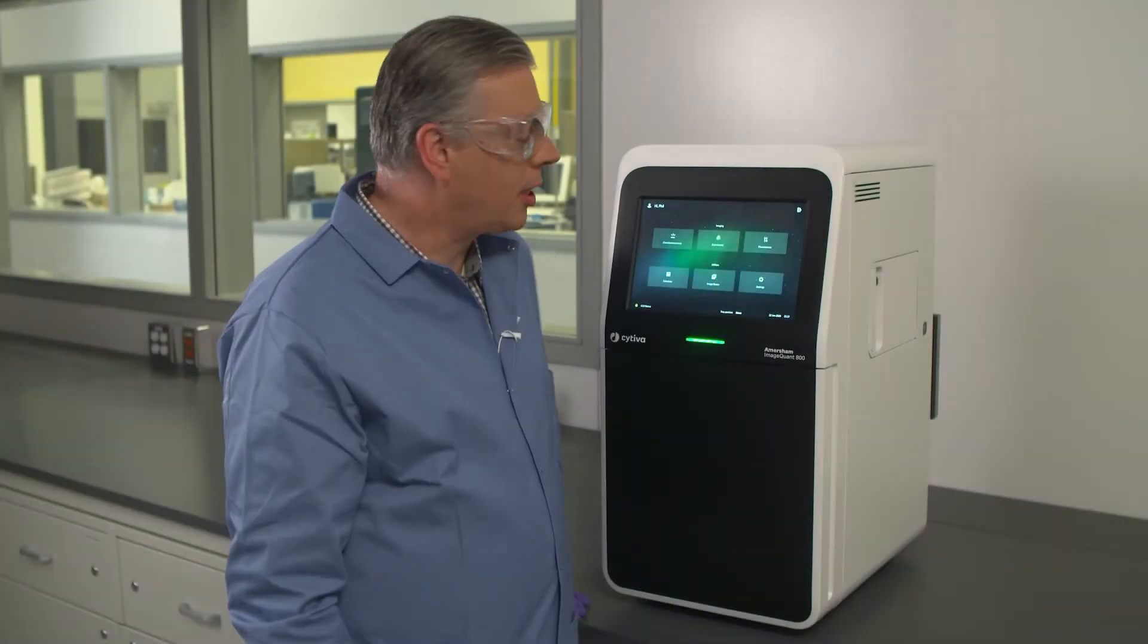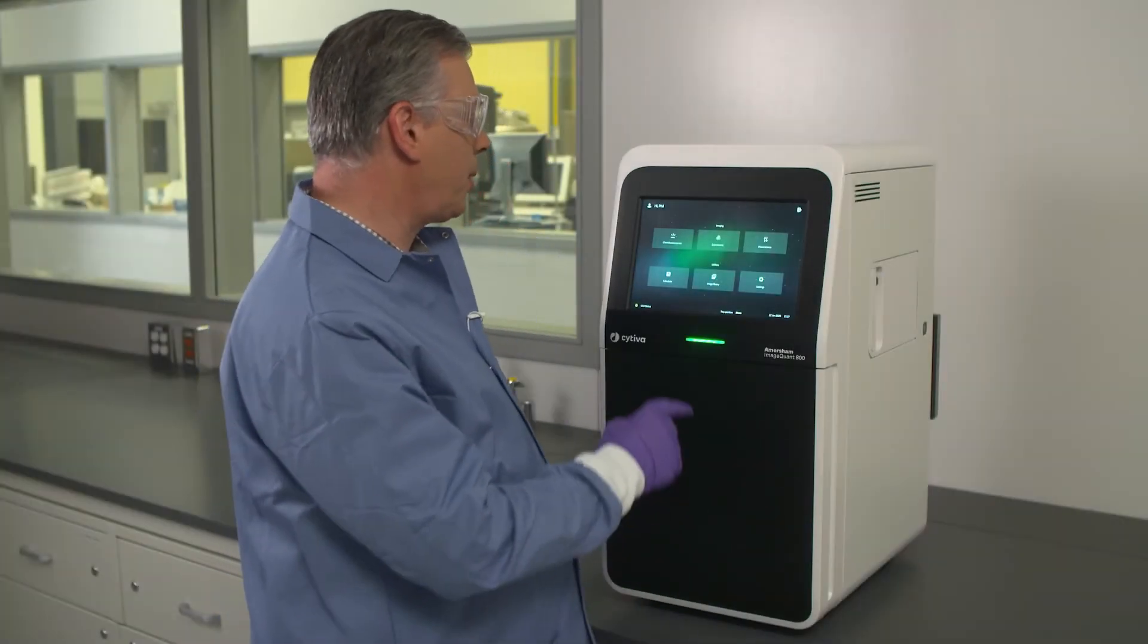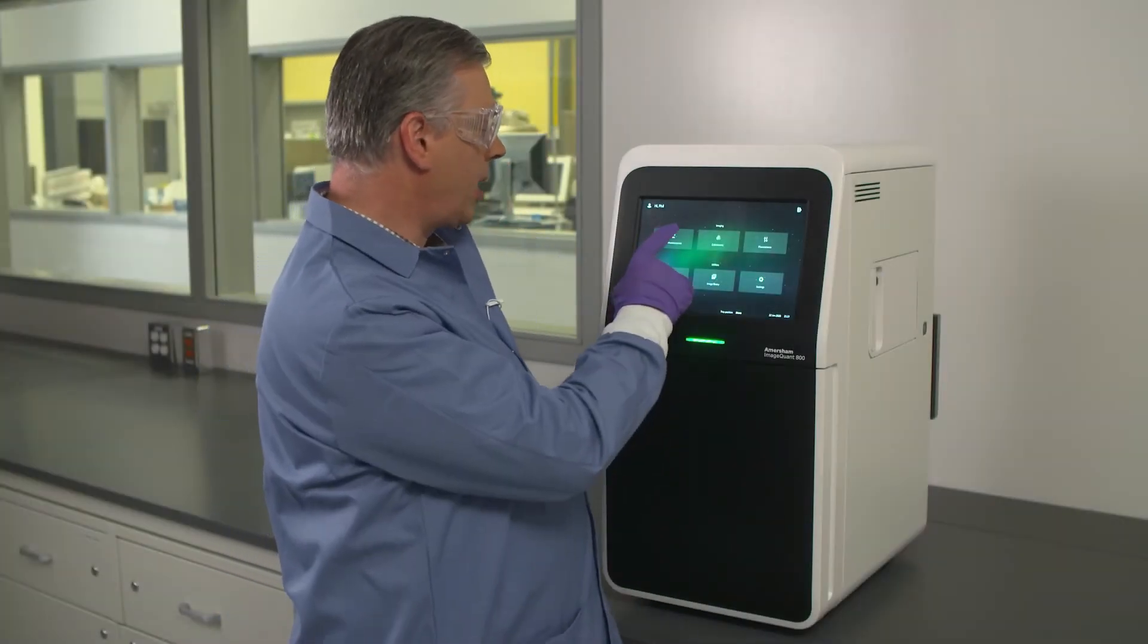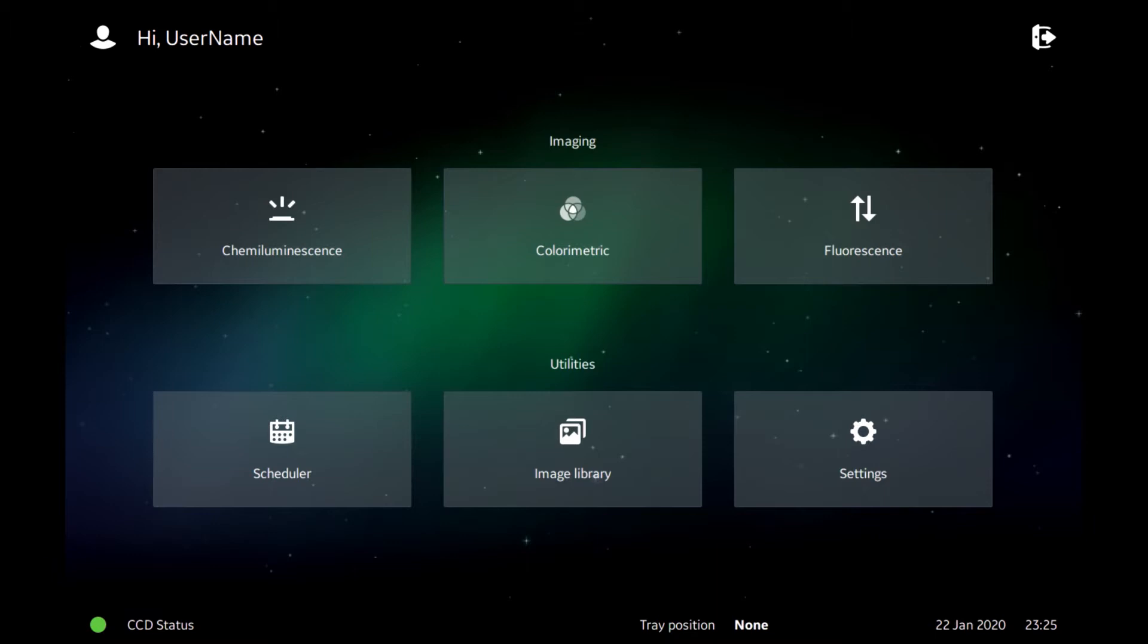The ImageQuant 800 comes equipped with multiple exposure modes for chemiluminescent imaging. In this session we're going to look at chemiluminescent imaging and how to program that.